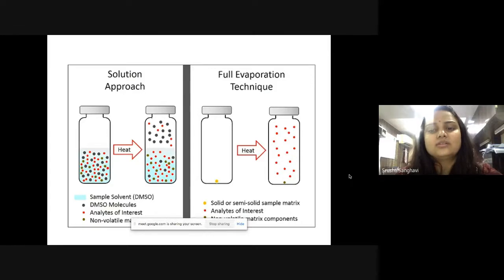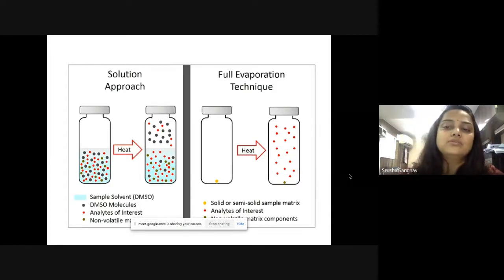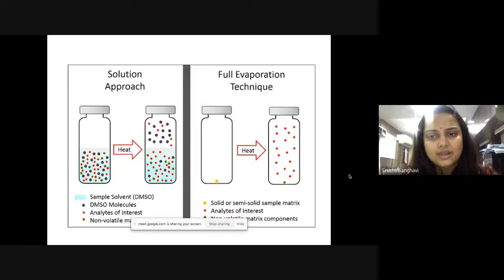And when you heat it, the pav bhaji masala, whether it is clove oil, cinnamon oil, eucalyptus oil, whatever else is there, all those spices' volatile components will keep on floating in the headspace vial. The solid component, the composition of which will also change. So the yellow dot, which was a big one, turns into a brown dot with all the volatile components lying around in that vial.